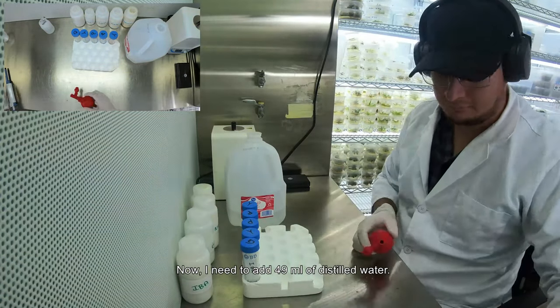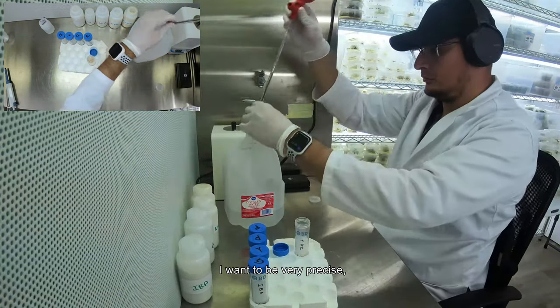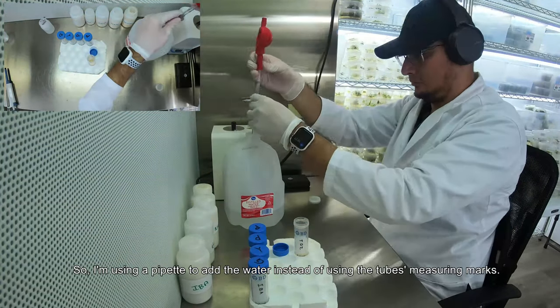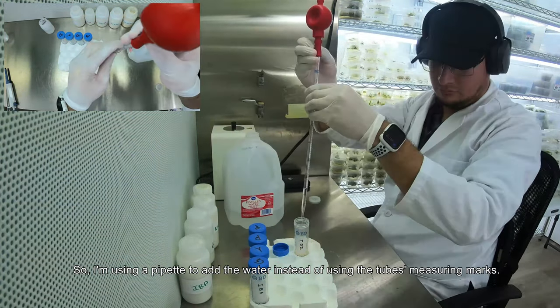Now I need to add 49 ml of distilled water. I want to be very precise, so I'm using a pipette to add the water instead of using the tube's measuring marks.